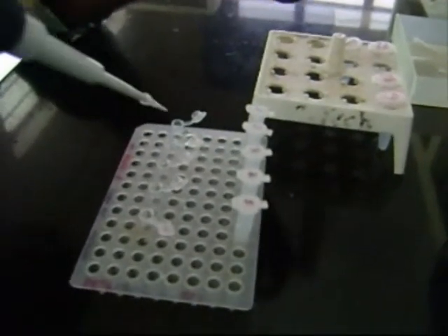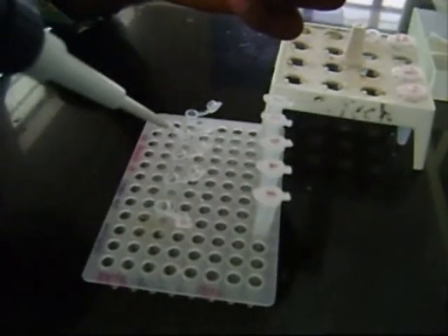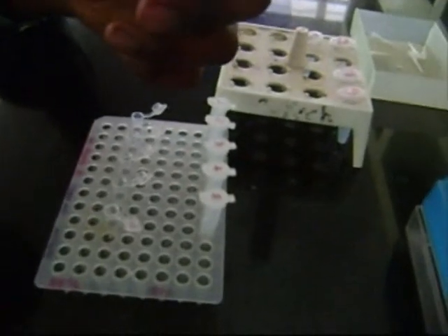1.5 microliter of dNTPs are added. It is a mixture of various nucleotides and acts as a pool for the source of nucleotides for elongation of the DNA molecule.